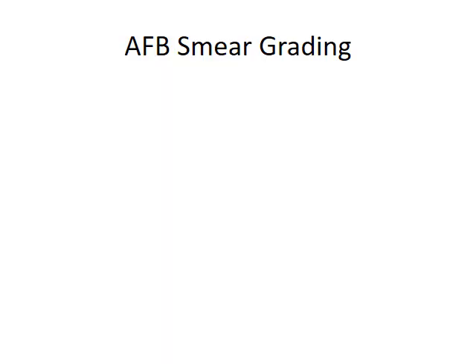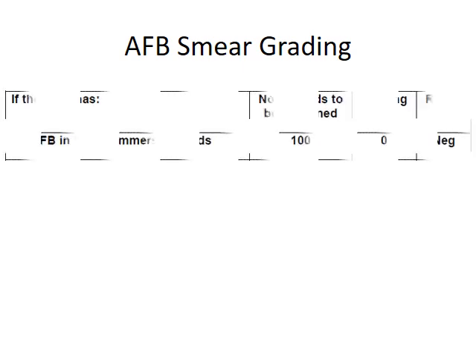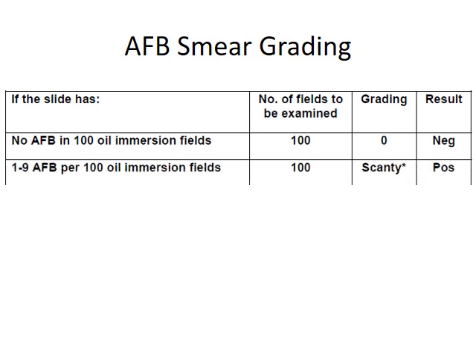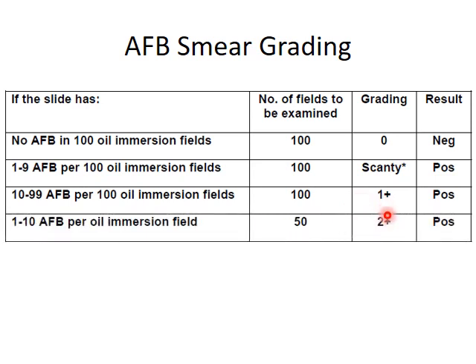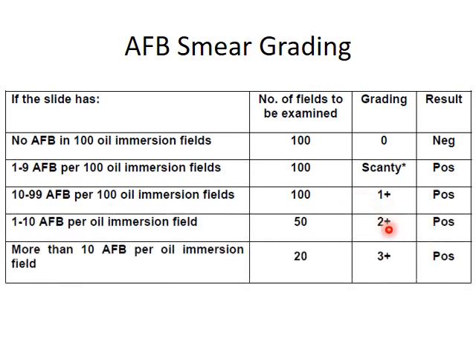As we can see here in the ZN staining, we can see the acid-fast bacilli against the blue background. The ZN stain grading system is: negative, scanty, plus one, plus two, and plus three.